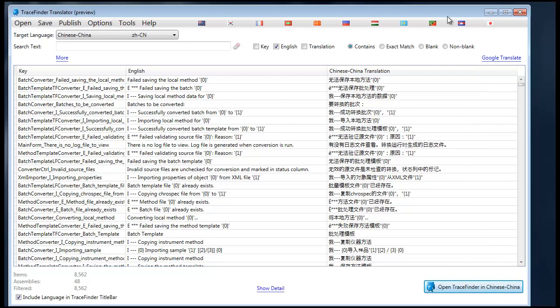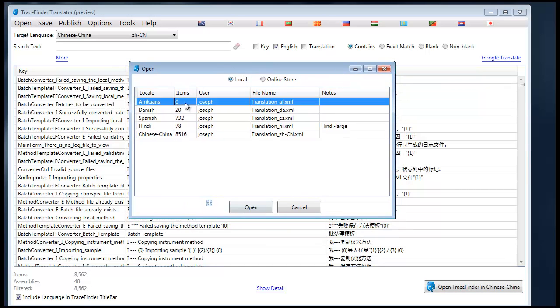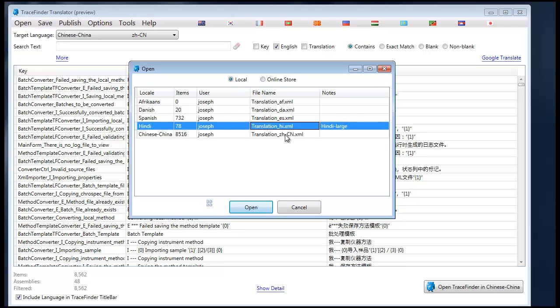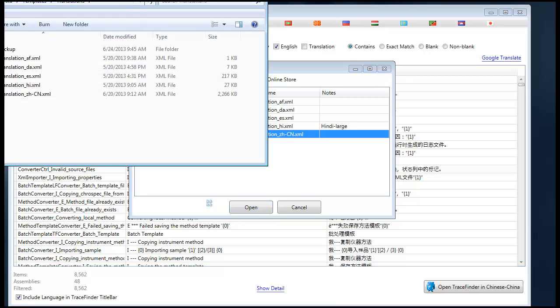Now that you have some context, let's go through the various functions of TraceFinder Translator. You can open up a translation file. You'll notice that translation files are the word 'translation', underscore, and the language code. There is only one translation per locale.